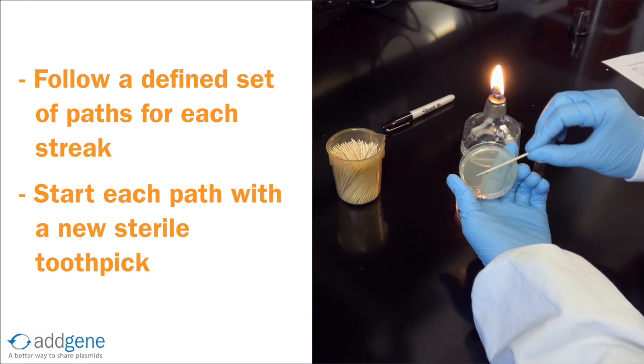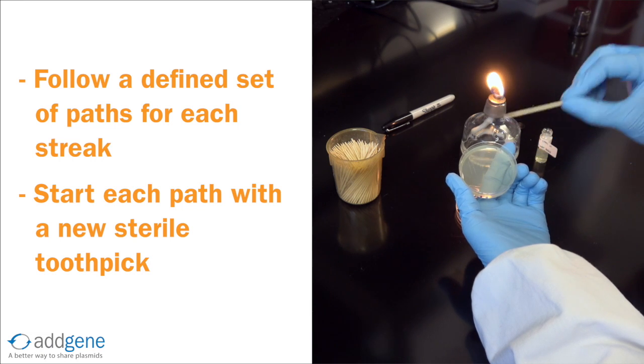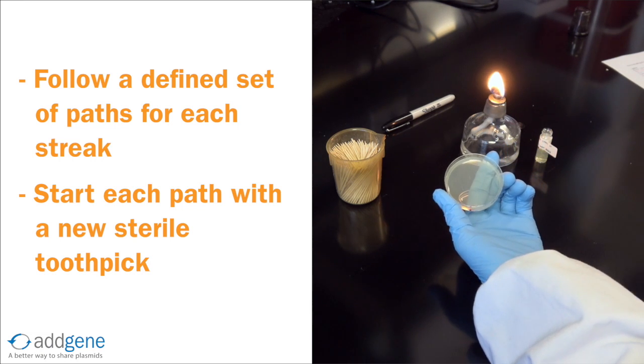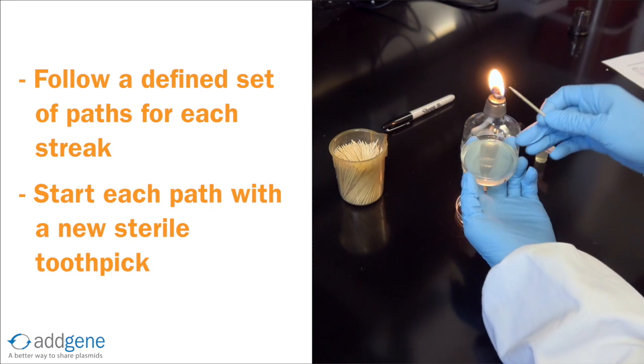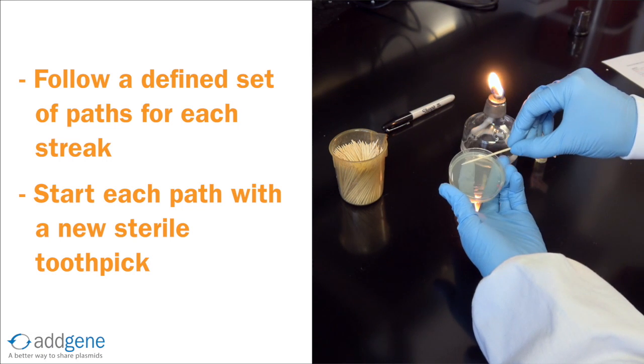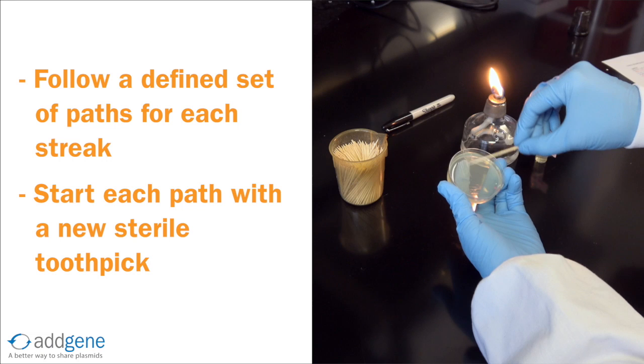With the first toothpick, we gently streak back and forth across roughly one third of the plate, taking care to avoid the edges. We then dispose of the first toothpick, turn the plate, and use a new sterile toothpick to start streaking a new path from where we left off.